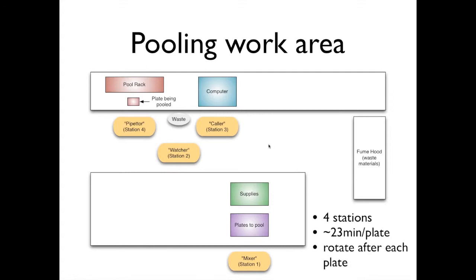So we thought, let's go ahead and get started on our project of making pools. This was some years ago, even before we were doing sequencing. And just get going with what we can in an ordinary lab without spending a lot of money. So this is our pooling work area.